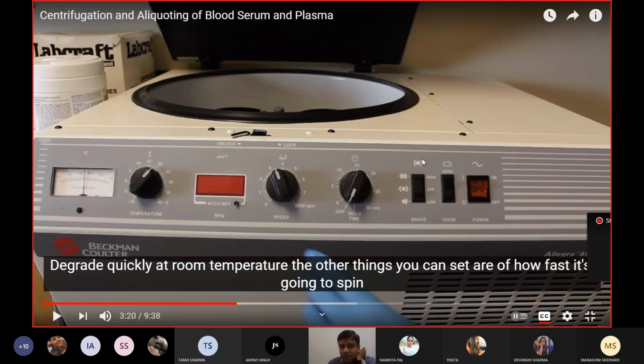We set the temperature, so it could be 4 degrees, 8 degrees, whatever temperature you are looking for. In that case this chamber becomes cold. So we are basically talking about the temperature inside this chamber.